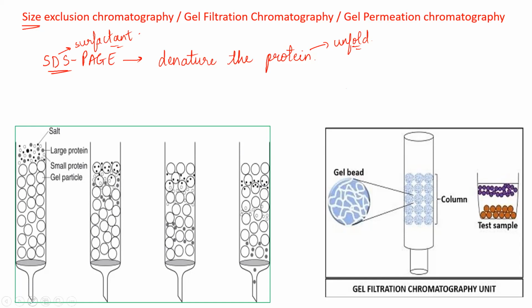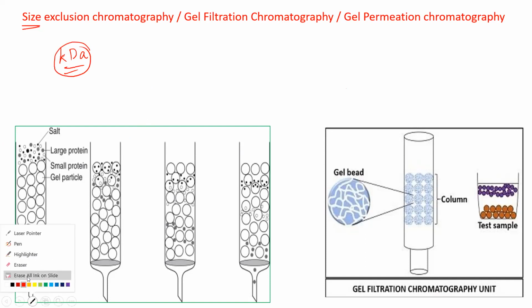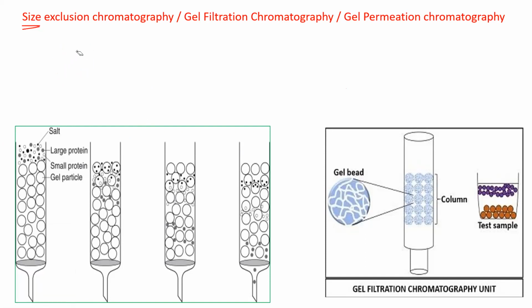Now we are going to see again what the stationary phase is and how important the stationary phase is. Now when I mention molecular mass, the protein's molecular mass is always mentioned in kilodaltons, which is also written as kDa. It is not in mg or grams; the unit for the molecular mass of proteins is kilodaltons. You will frequently read this term in your books and in the slides. Again, the larger the size of the protein, the larger the mass, the larger will be the kilodalton value.